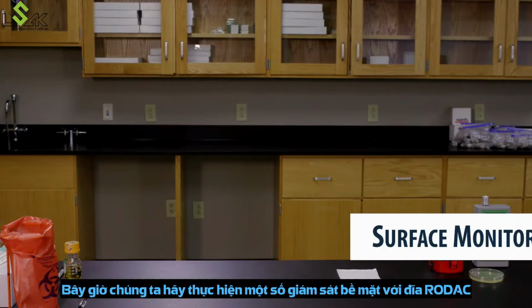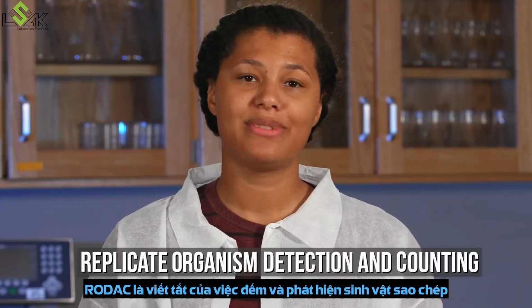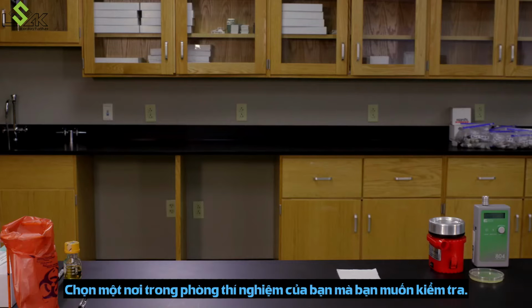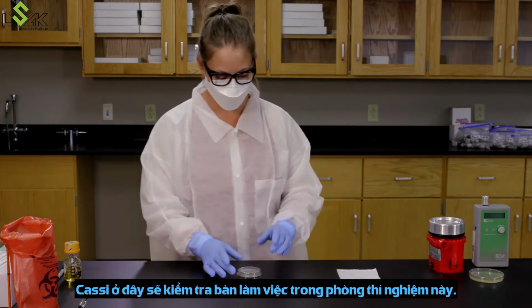Now let's do some surface monitoring with a RODAC plate. RODAC stands for Replicate Organism Detection and Counting. That's a mouthful, which is why we just say RODAC. Choose a place in your lab that you want to test. Cassie here is going to test this lab workbench.